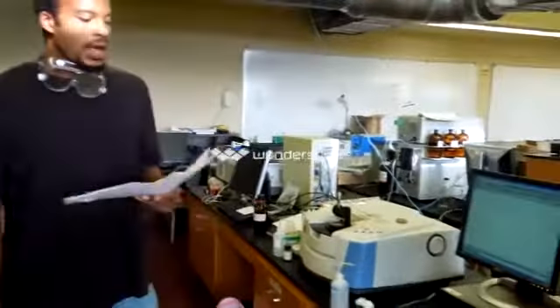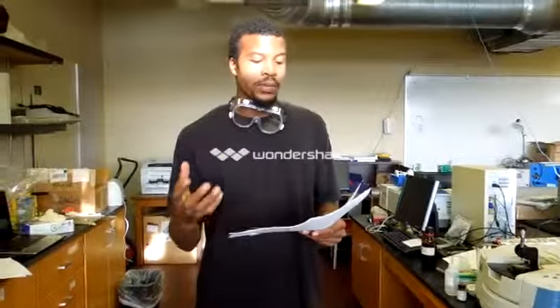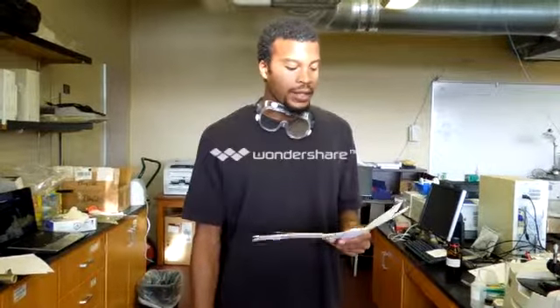Today we're discussing spectroscopy, specifically IR, which is infrared radiation. You can use this in organic chemistry to help you determine or verify which structures you have in any compound. The way IR works is radiation is emitted by an IR machine here, and the bonds in between the atoms are going to absorb specific frequencies that are emitted by that IR machine. They have varying intensities and, like I said, frequencies.